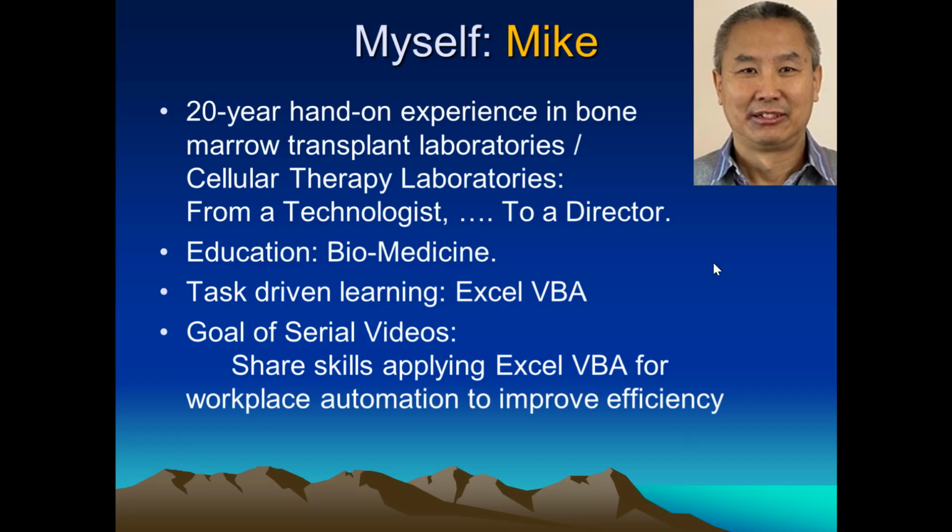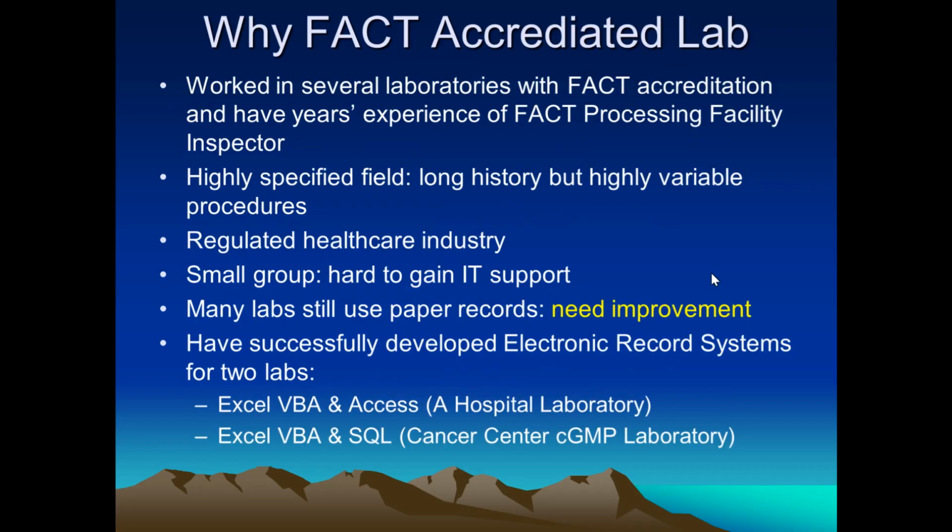My education is biomedicine, but I like computers and set a goal to use a database for my work. So this was task-driven learning by myself from Google and from books, and I learned Excel VBA. The goal of this video series is to share the skills I applied for this work, how to make workplace automation to improve efficiency.